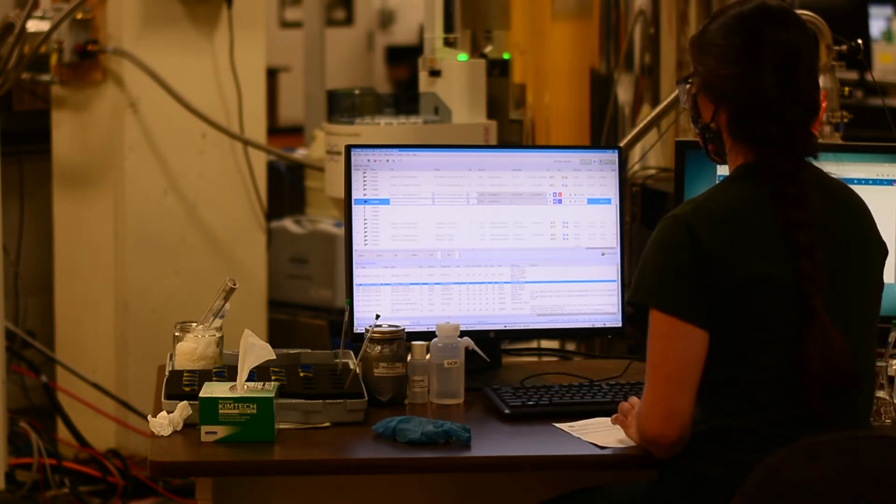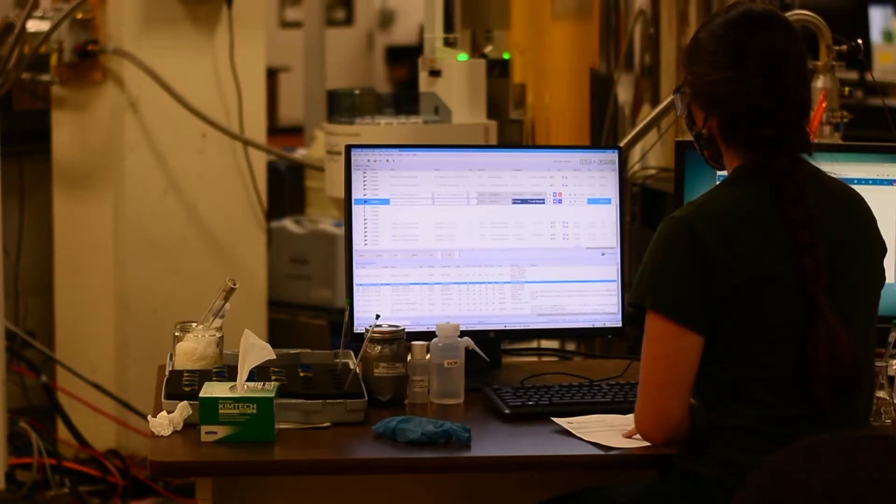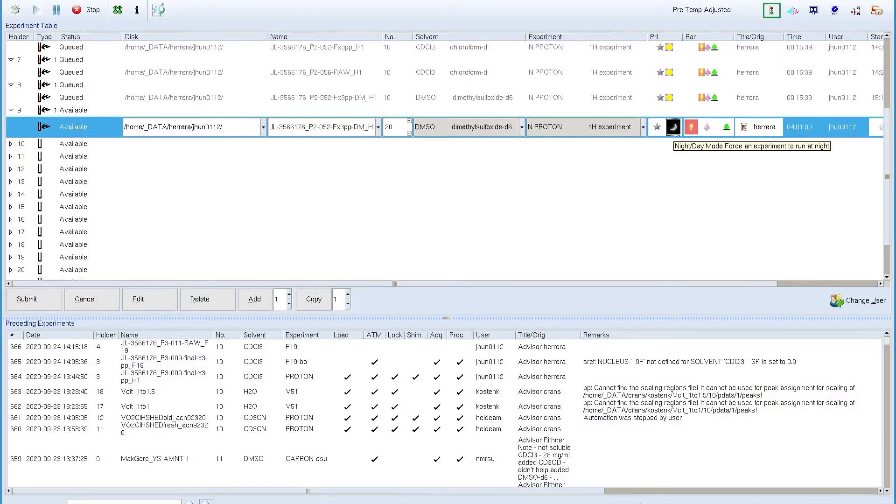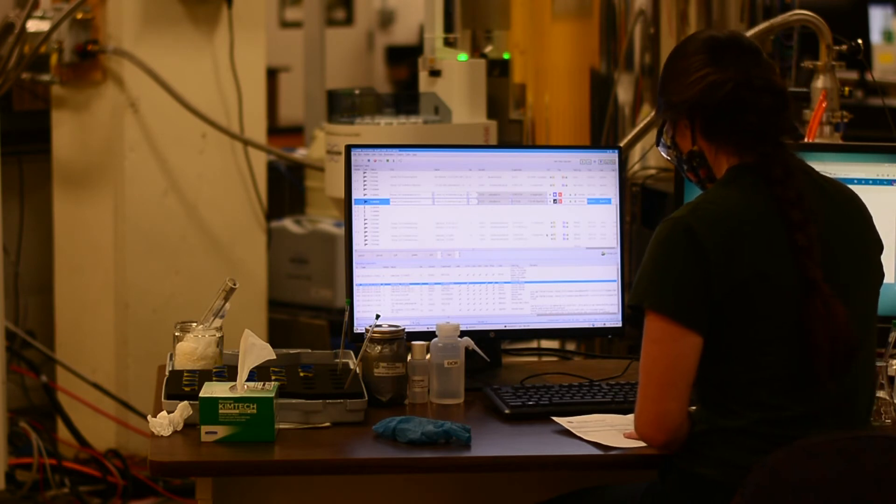If you have a sample that will run for a longer run time than you're allotted during the day, you can shift that sample into the night queue. If you click on the sun it will change to a moon and that will move the sample into the night queue where longer acquisition times are permitted.